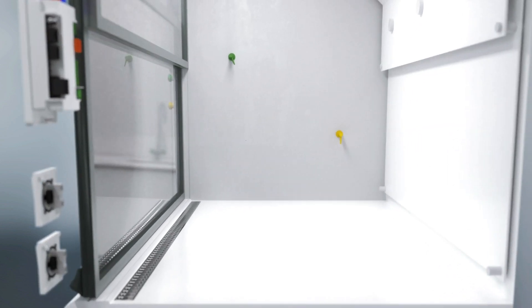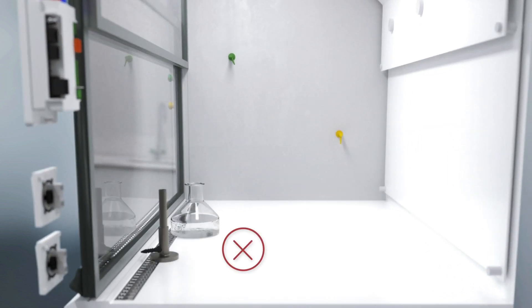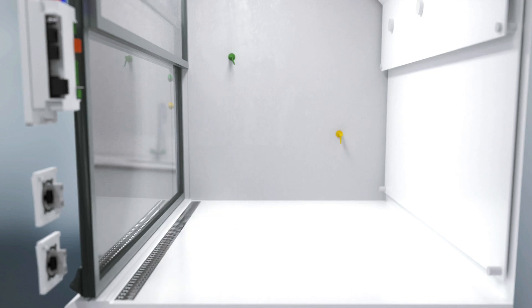To allow a correct inflow, it is important to not place any equipment directly on the airfoil. Instead, store them in the back of the fume hood.